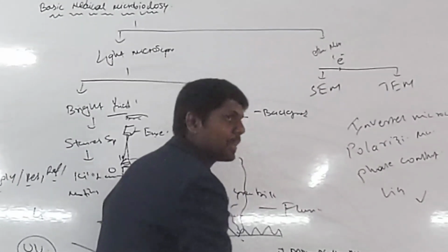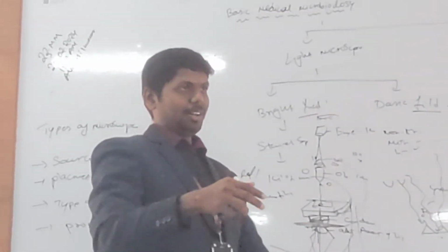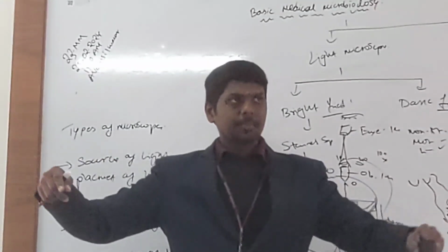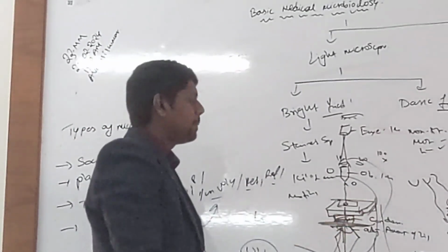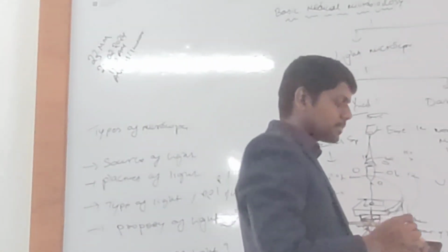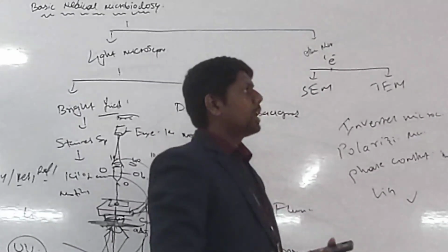Multi-headed microscope. You can Google it, you will get it. It's a stand with multiple eyepieces. It's a modified microscope. Yeah, fine. Then refractory effects.